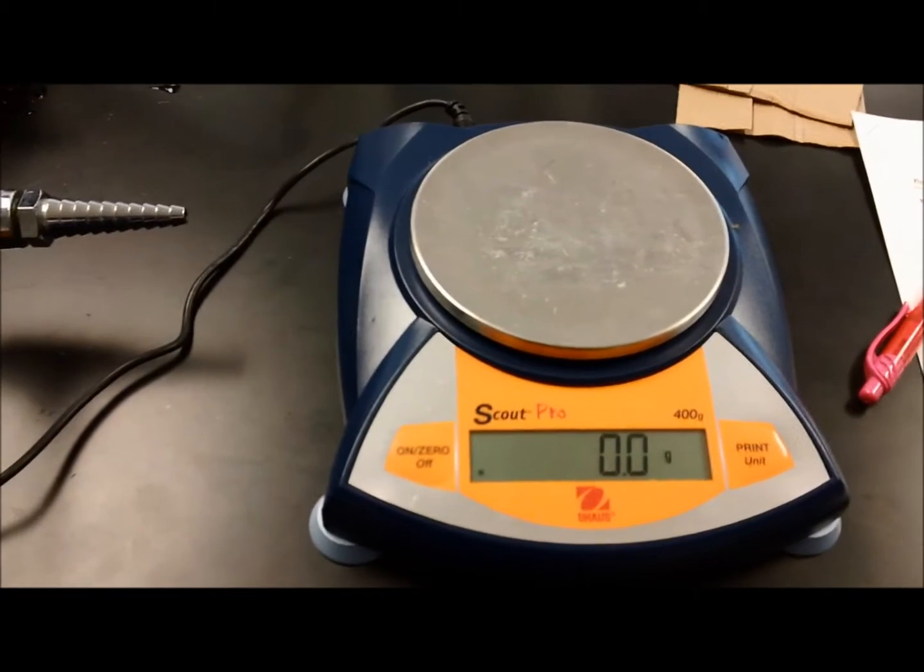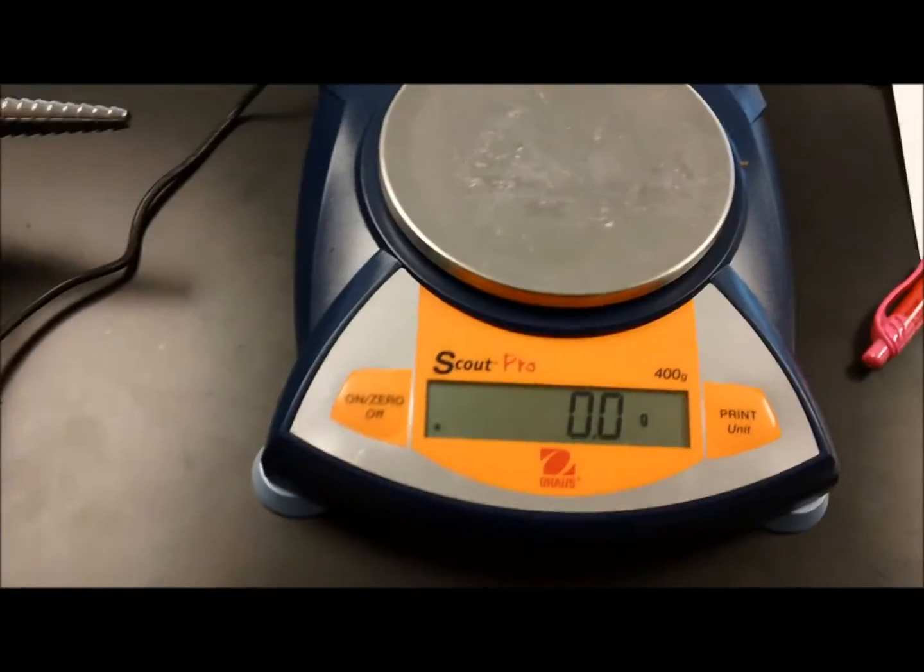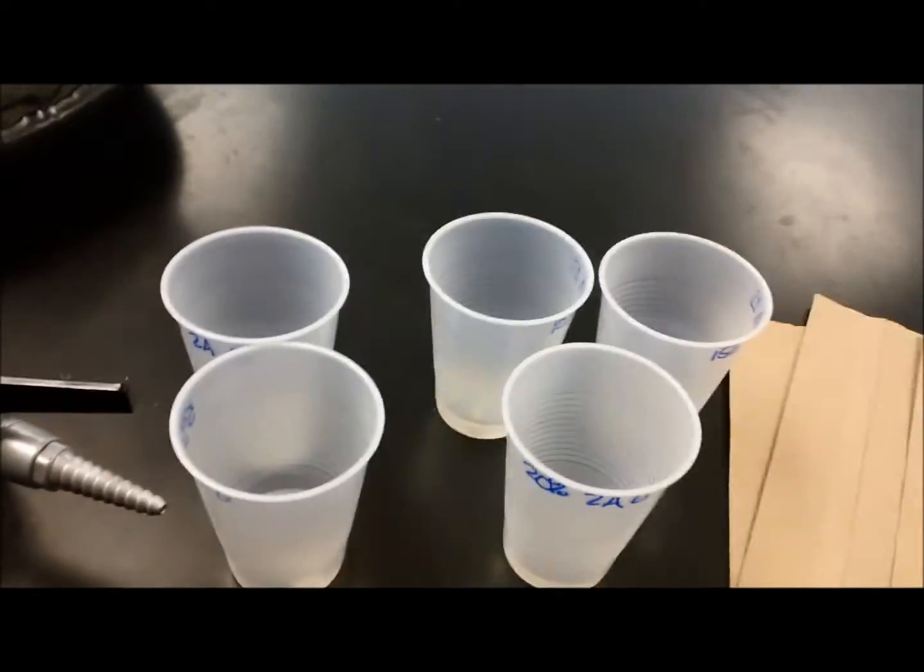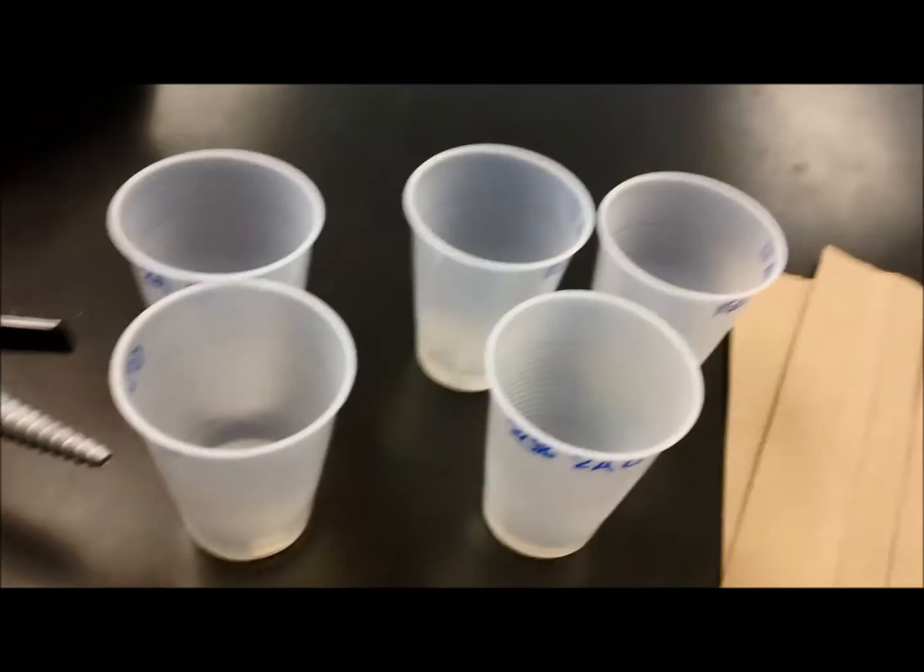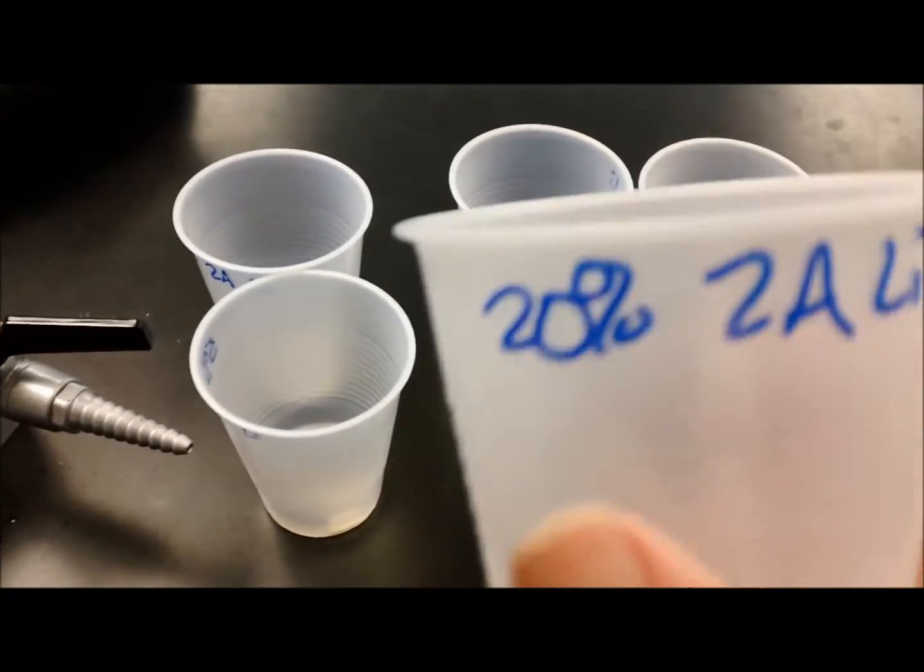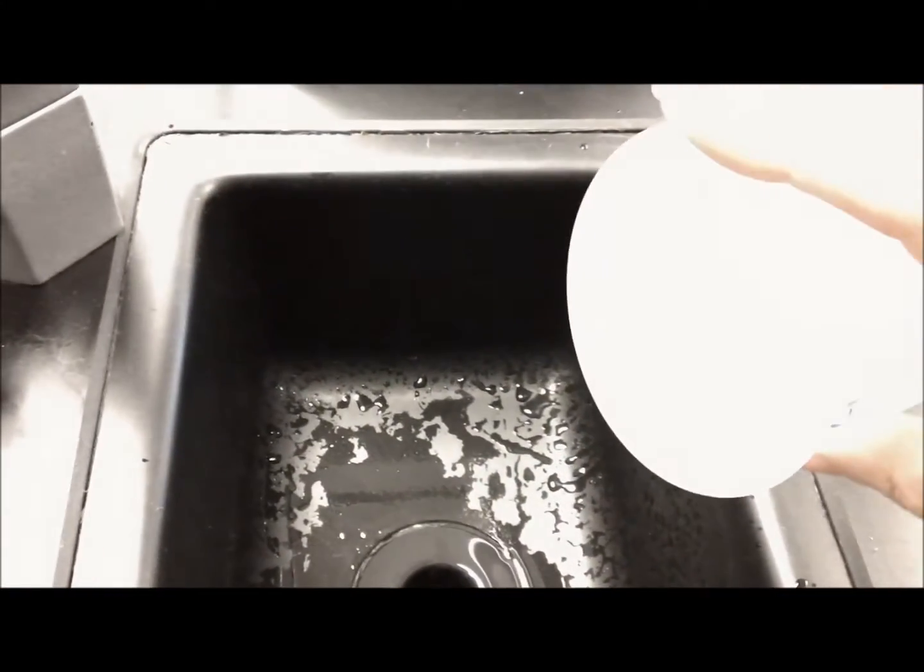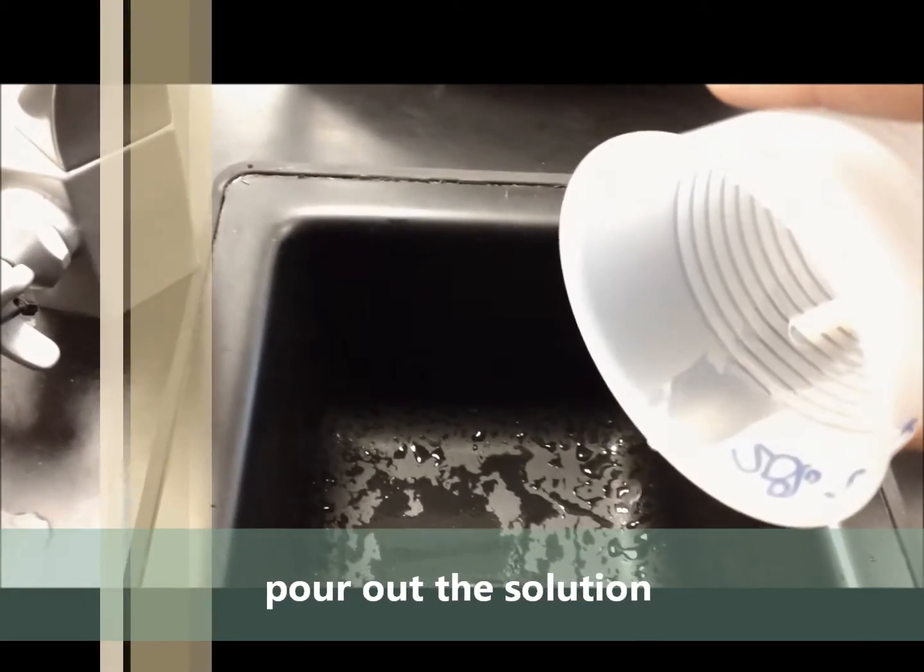For part two of the lab, you will need your initial data, a scale, and your five solutions with the potato pieces in. To start, choose one of the solutions. We're going to start with the 20% and carefully pour out the solution. We don't want any of our potato pieces to end up in the sink.